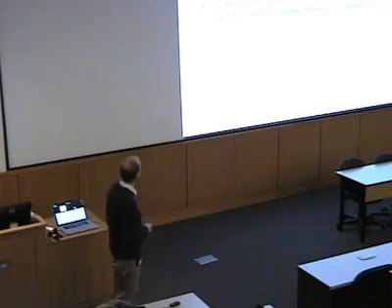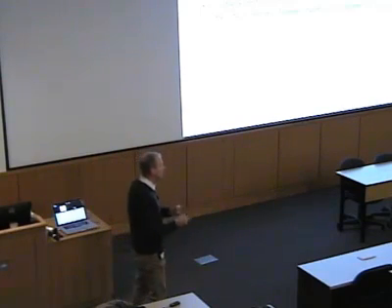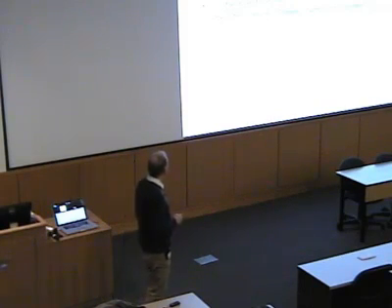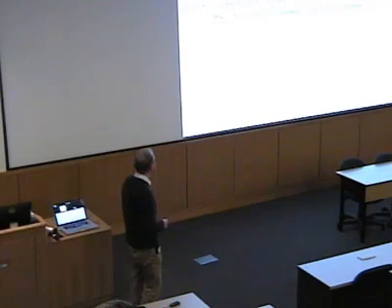Just by way of mentioning a few extra materials that are useful. If your interest is piqued by this talk and there were some details that you maybe wanted to know more about, here are some references. There's a very nice textbook that came out a couple of years ago by Hagen, which is called Biomolecular EPR Spectroscopy. I think this is very accessible to someone who doesn't have a strong background in physics. A problem for many students in trying to get into understanding EPR is that there's an awful lot of physics involved in it, and if you're an inorganic chemist, you're probably not so comfortable with that. This is written in a way that is very accessible.